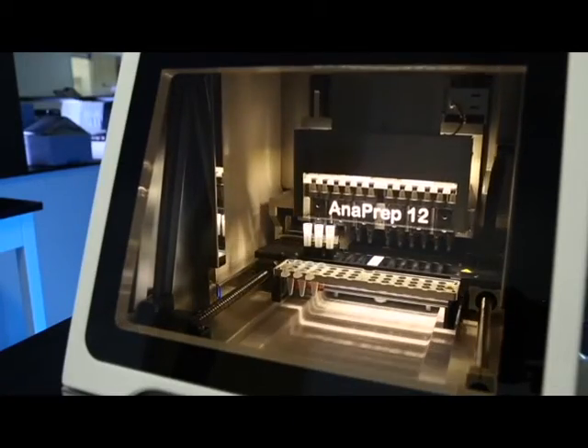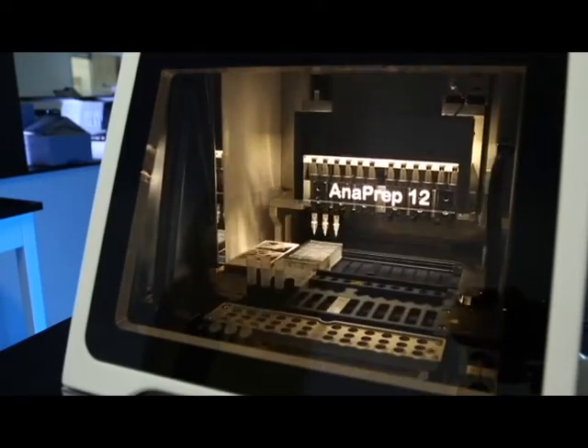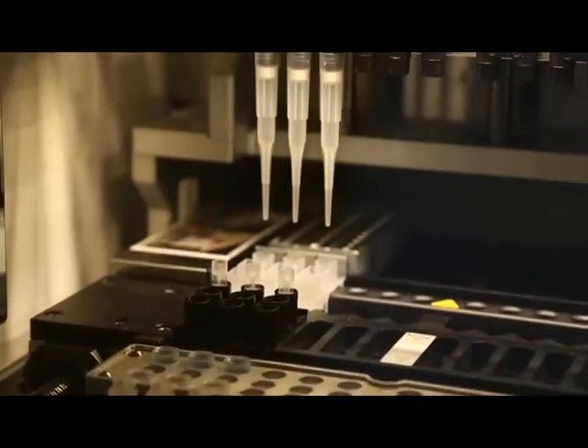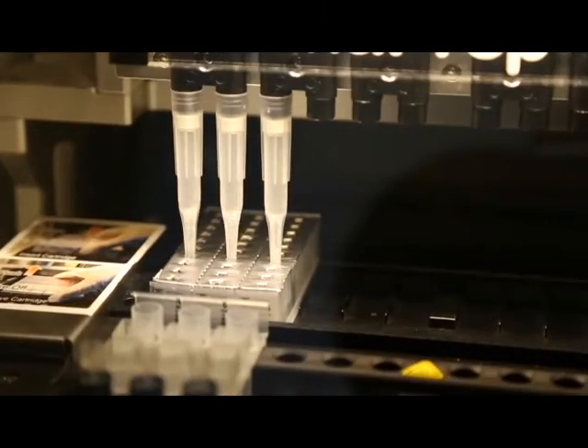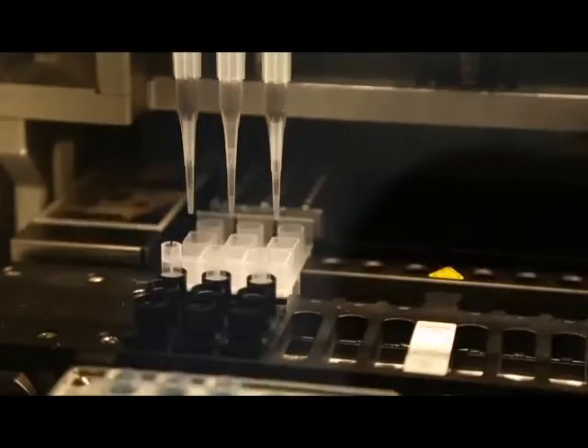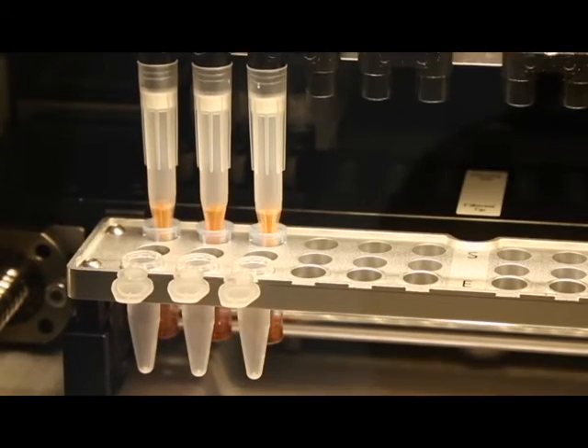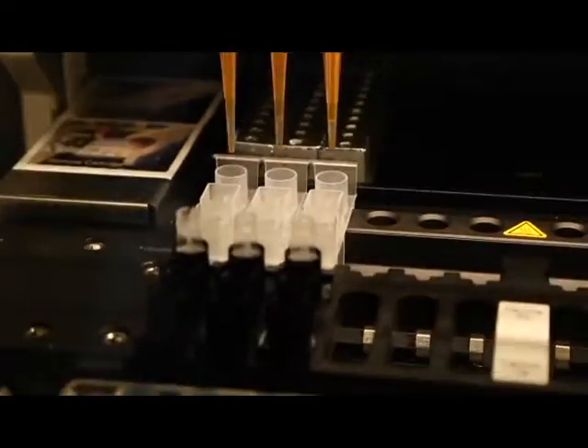This system contains a unidirectional auto-sampler that is based on magnetic bead technology. There is no cross-contamination and there is better bead capture than magnetic rod-based systems. It also outperforms tip-based systems because there is zero risk of bead clogging.